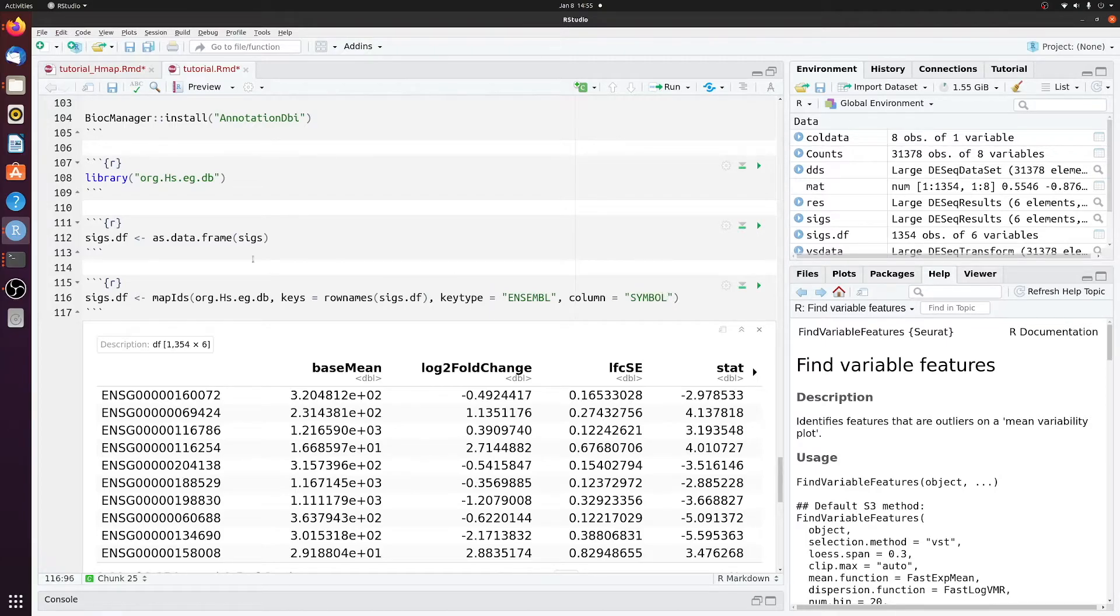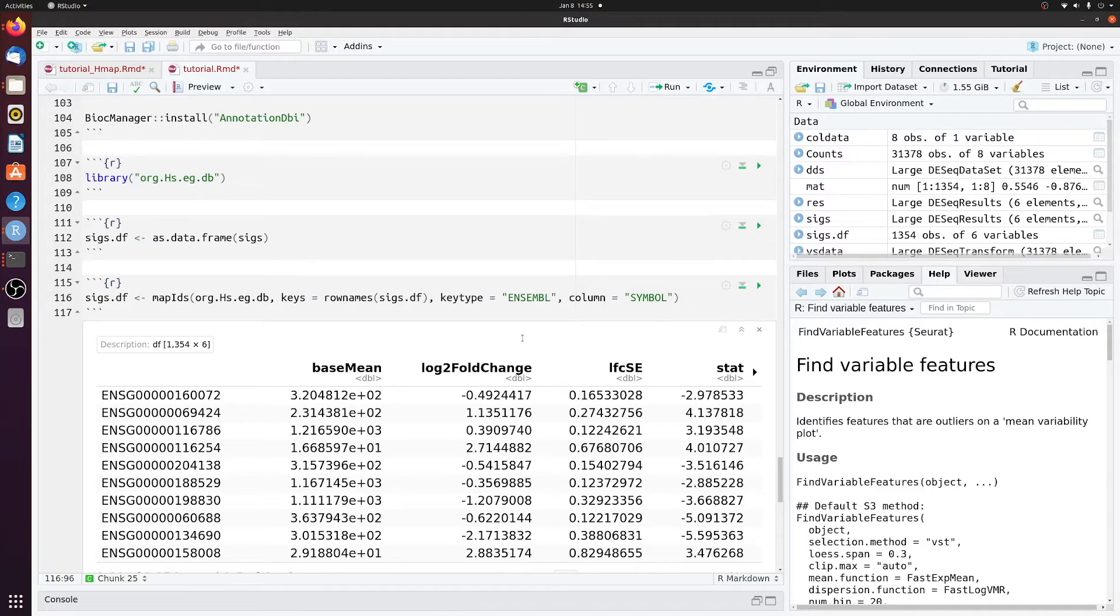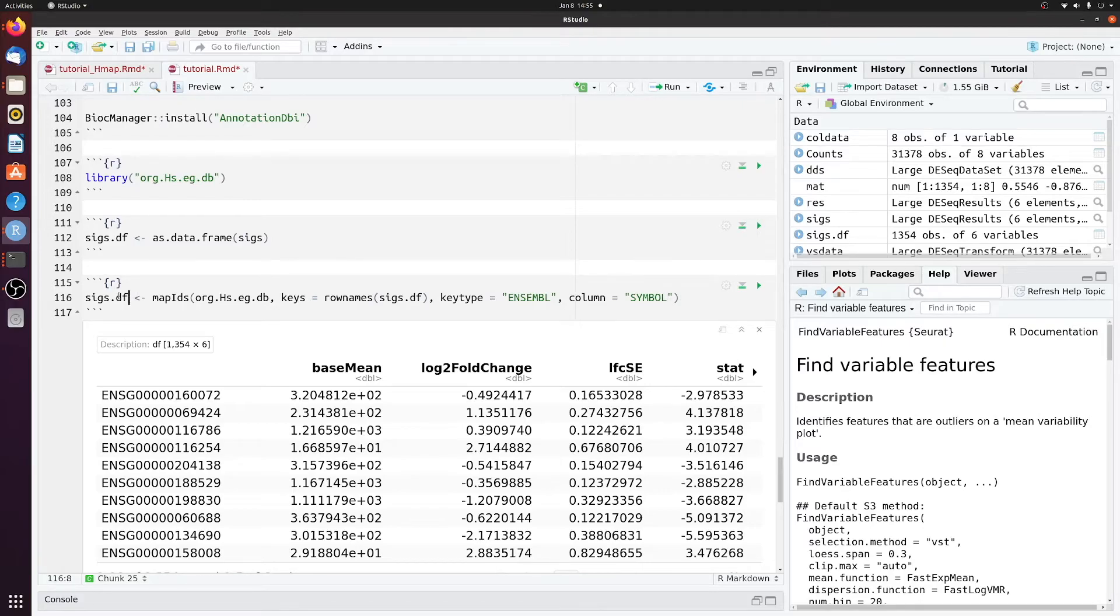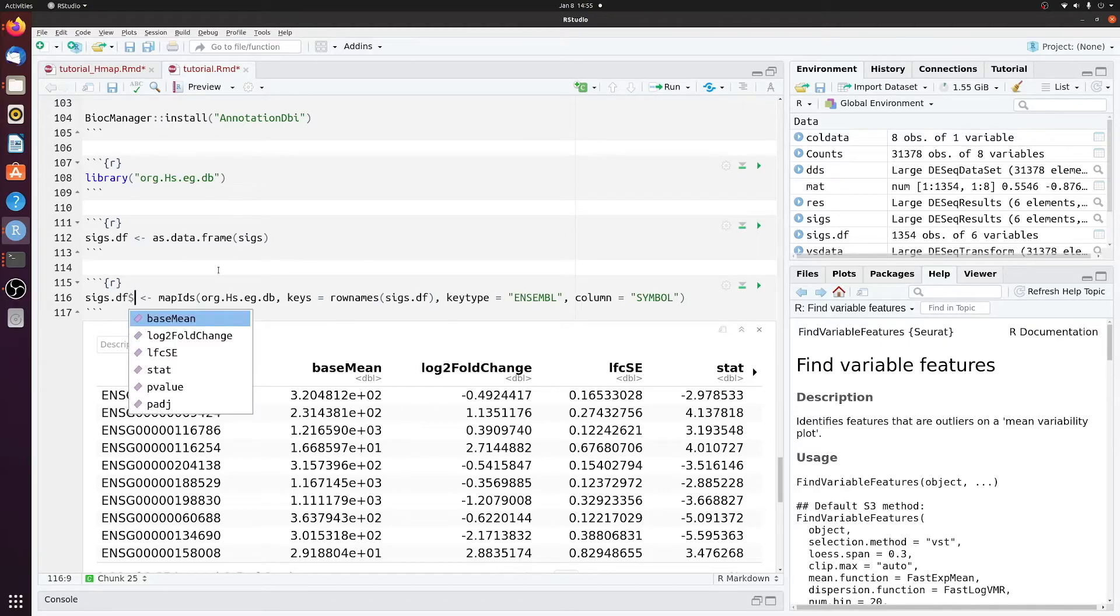You can also use this method to convert to other formats, such as NCBI entries or whatever formats. We want to make a new column in SIGsDF and we'll just call it symbol.